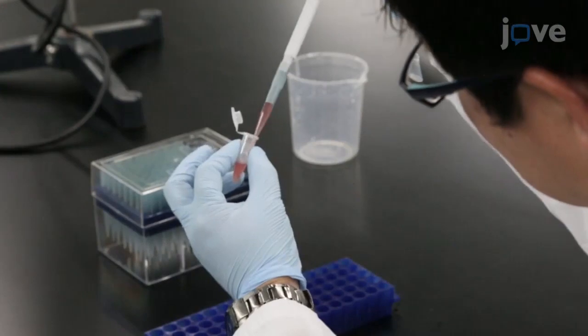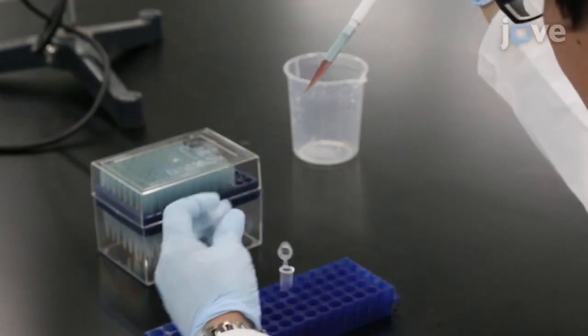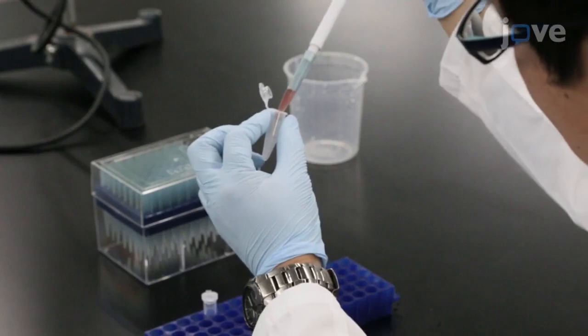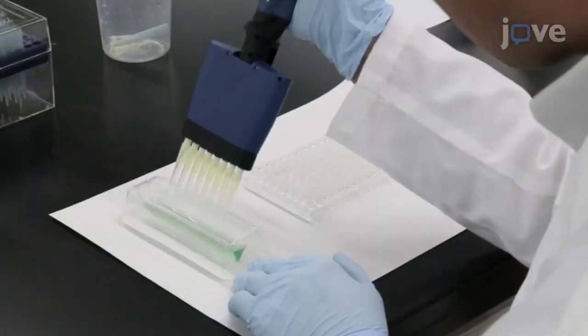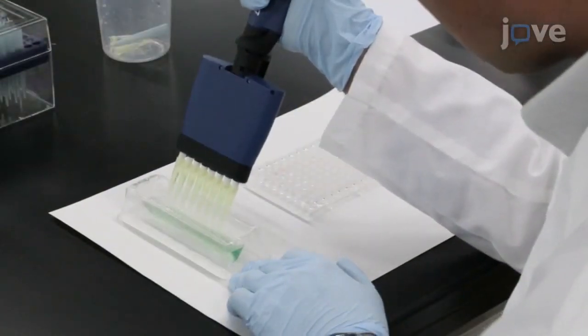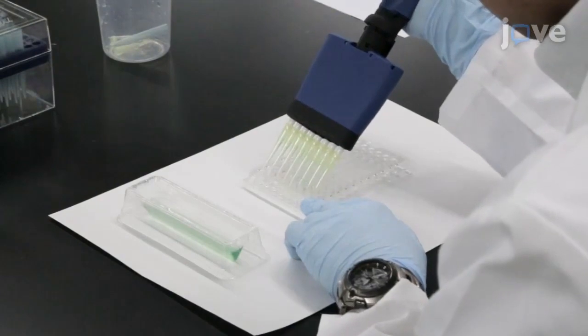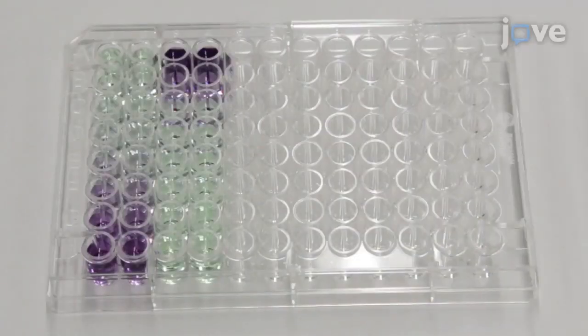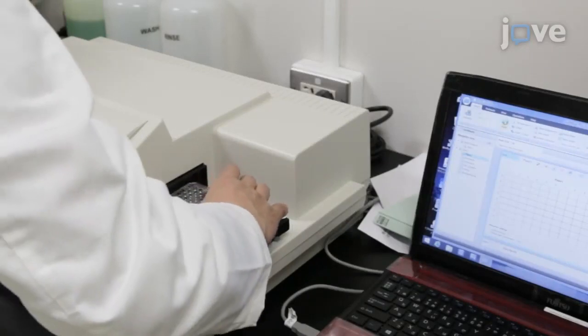Transfer 500 microliters of the supernatant to a new 1.5 milliliter plastic tube. Use 10 microliters of the sample to determine the protein concentration using methods such as the bicinchoninic acid assay or the Bradford assay.